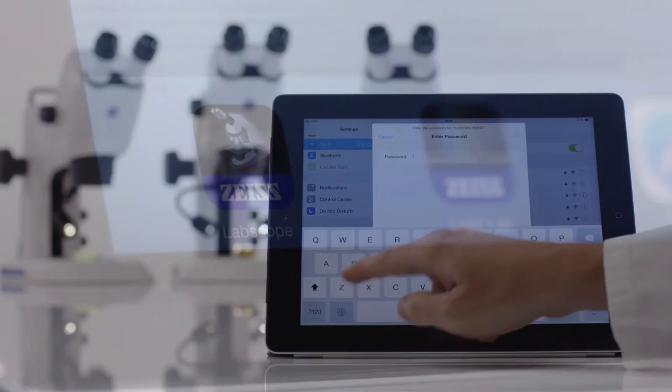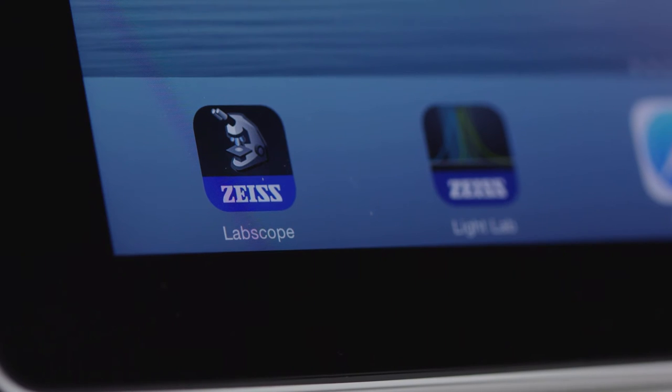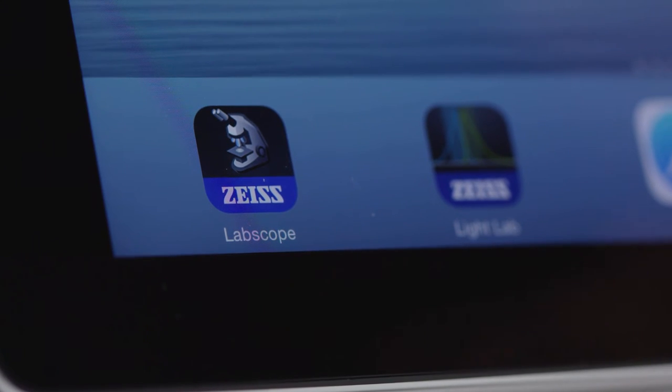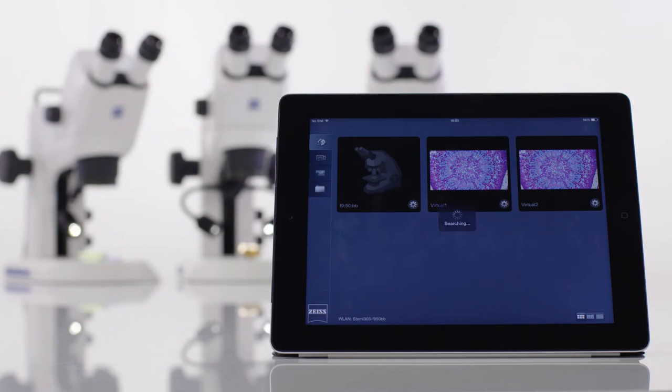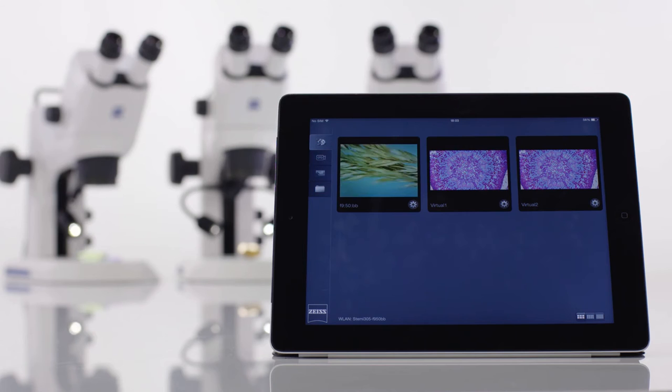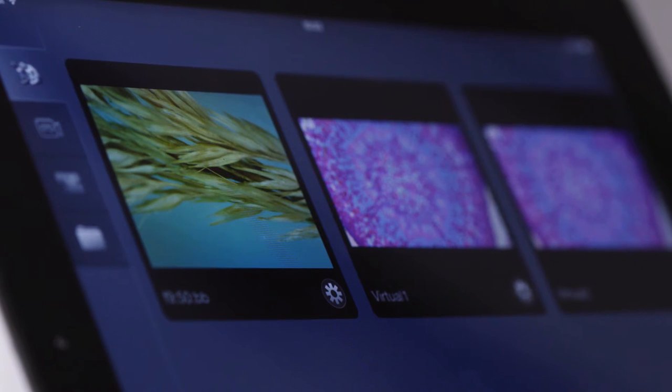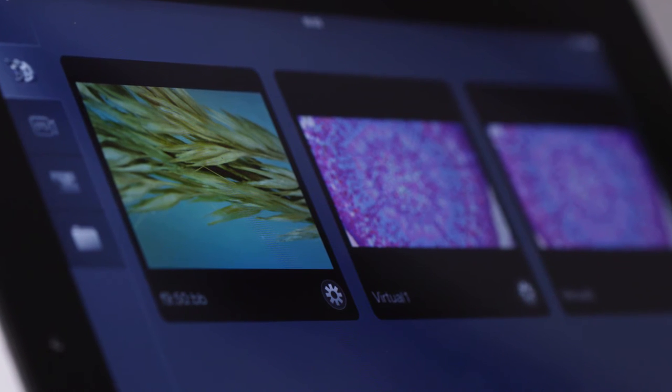You can download Zeiss LabScope, our free iPad imaging app, from Apple's App Store. Once installed, LabScope recognizes your STEMI 305 Cam automatically each time you switch it on, and the current live image from your microscope appears instantly as a thumbnail.